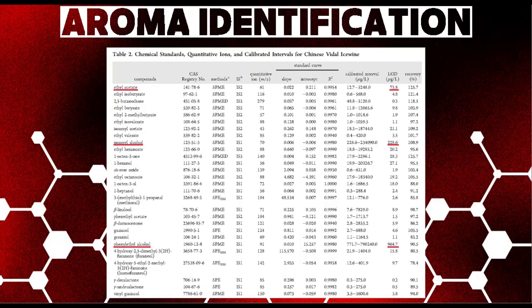On the right side, LOD stands for the limit of detection. The value represents the lowest concentration that the utilized method can detect. Given the methods used, the LODs of ethyl acetate, isoamyl alcohol, and phenylethyl alcohol were relatively high compared to other compounds, meaning that they must be present in higher concentration to be detected.